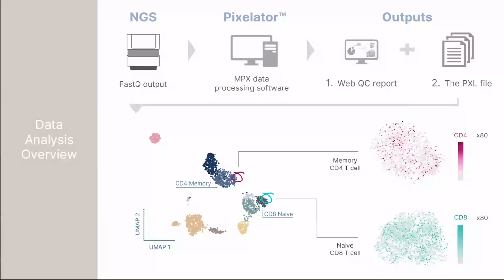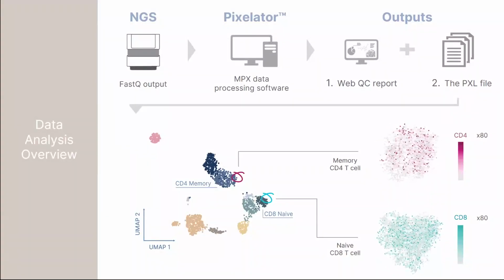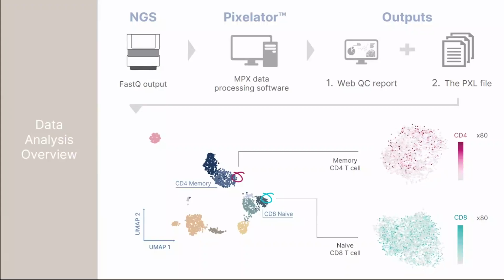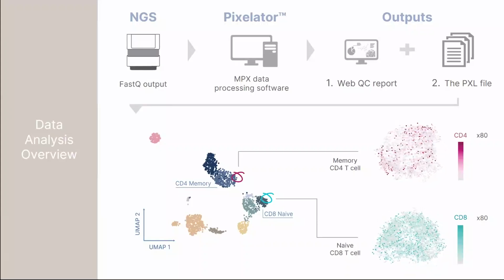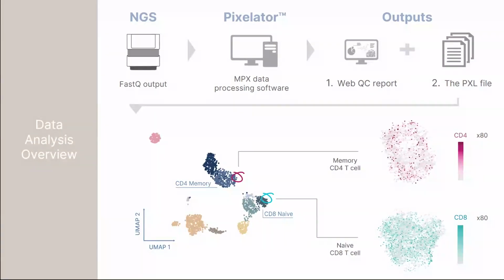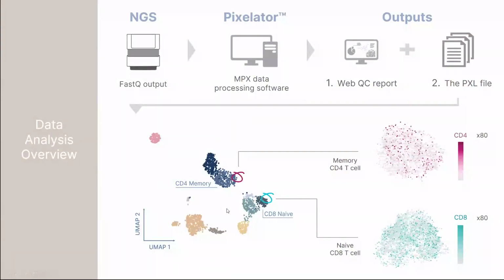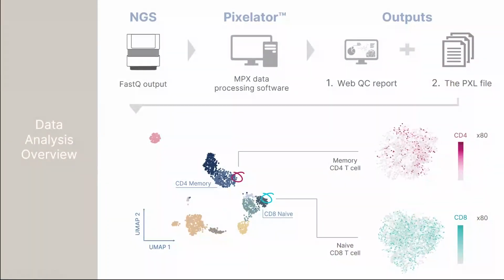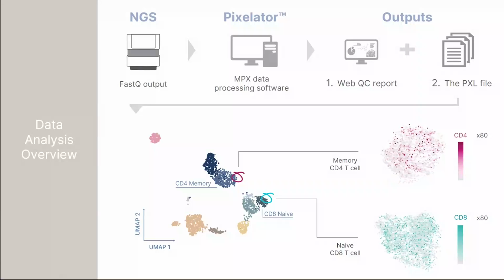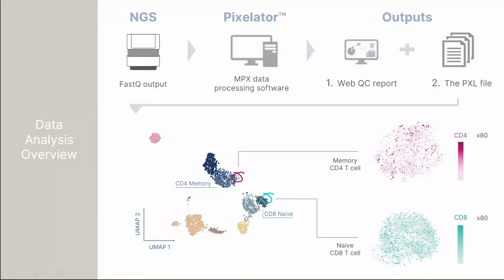And then just showing what that can look like. So you have a UMAP. I haven't written all of the different cell types here. We will come to that later. But as you can see here, you have a UMAP where each dot represents a cell belonging to a certain cell type. This is a PBMC, unstimulated PBMC is what you see here. And then we can choose one of these cells.